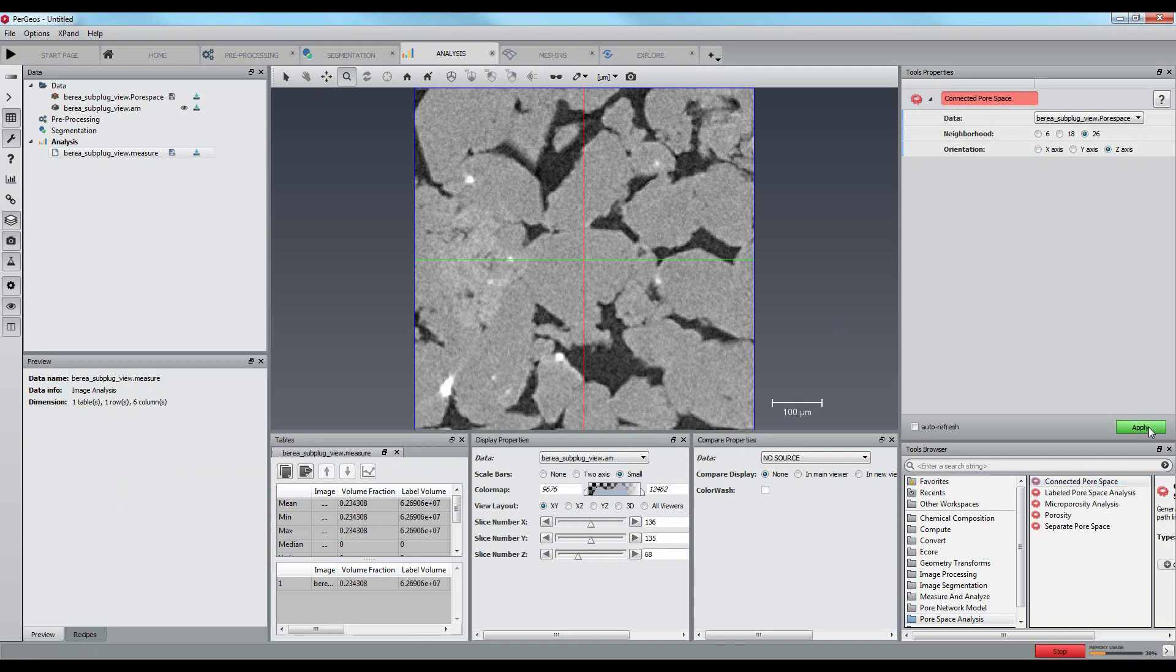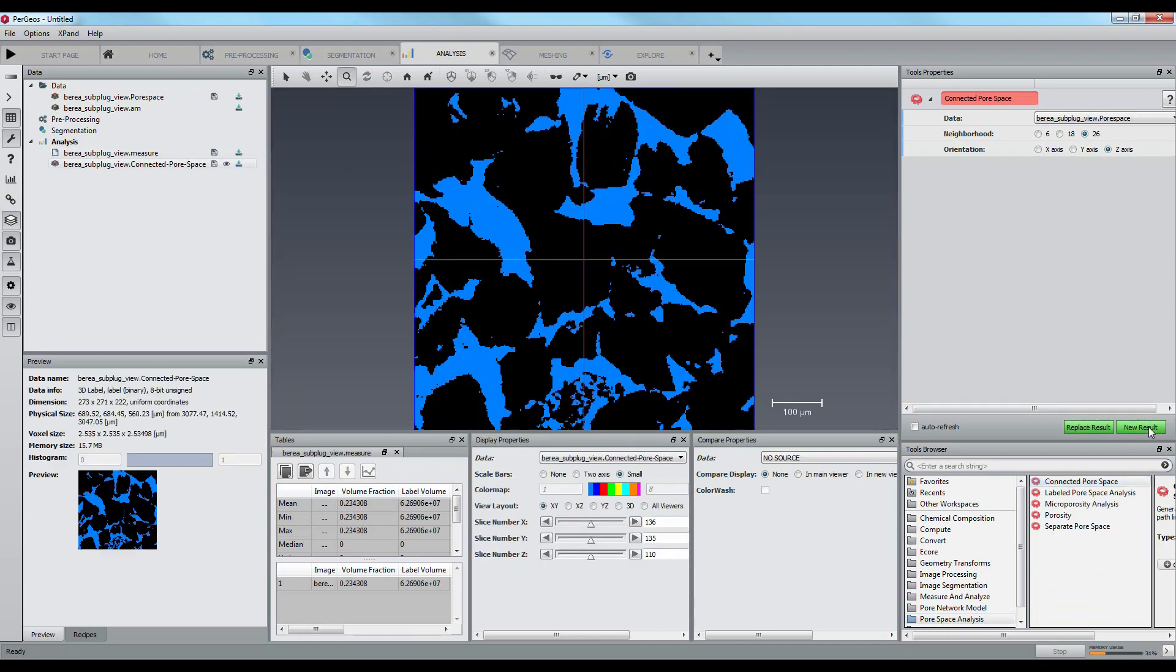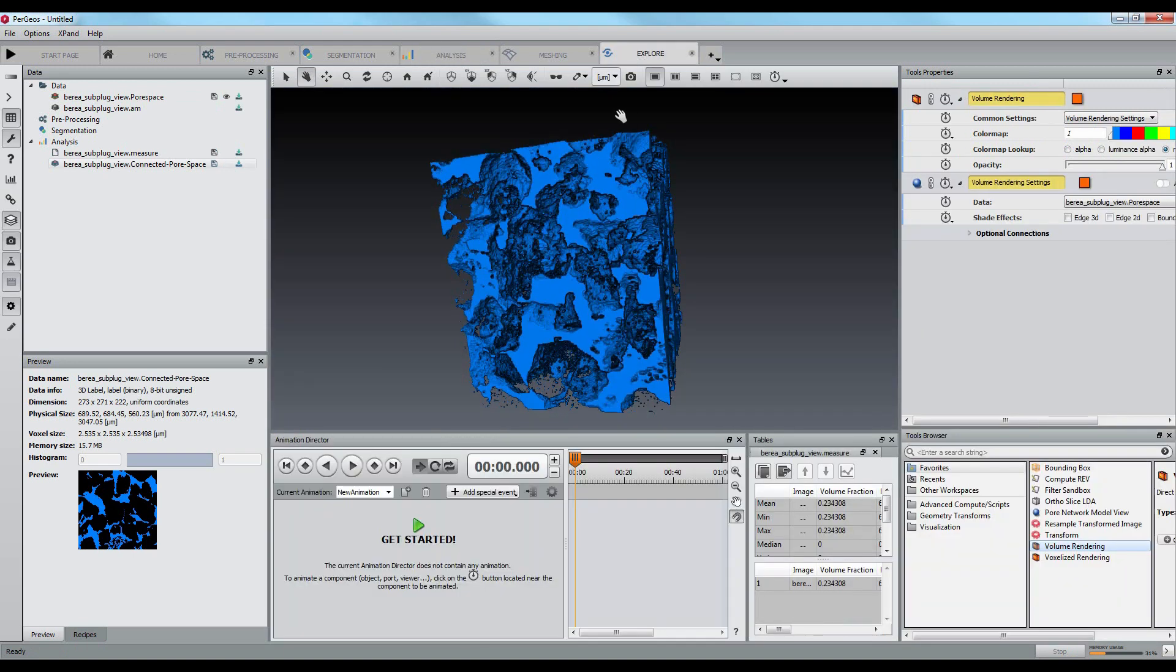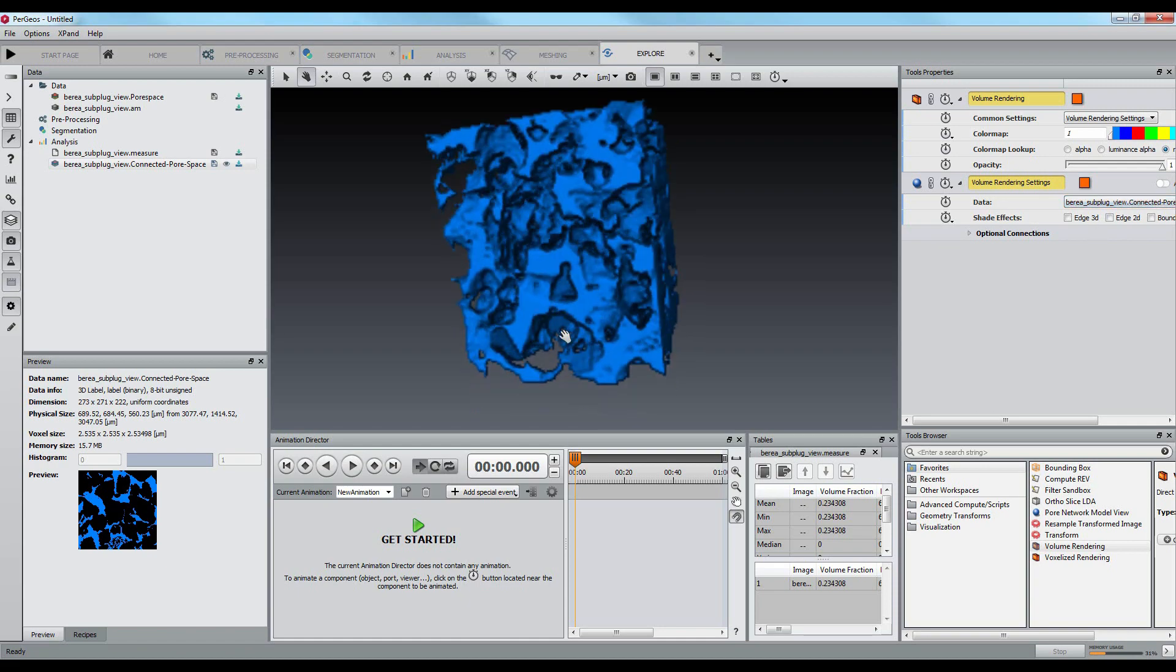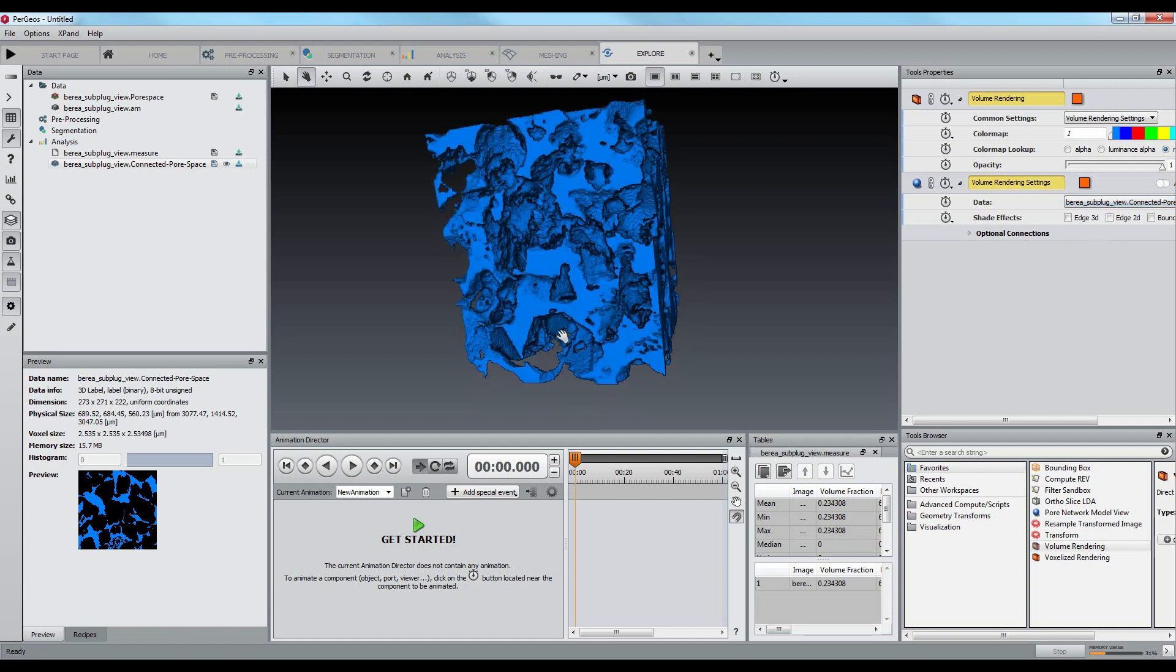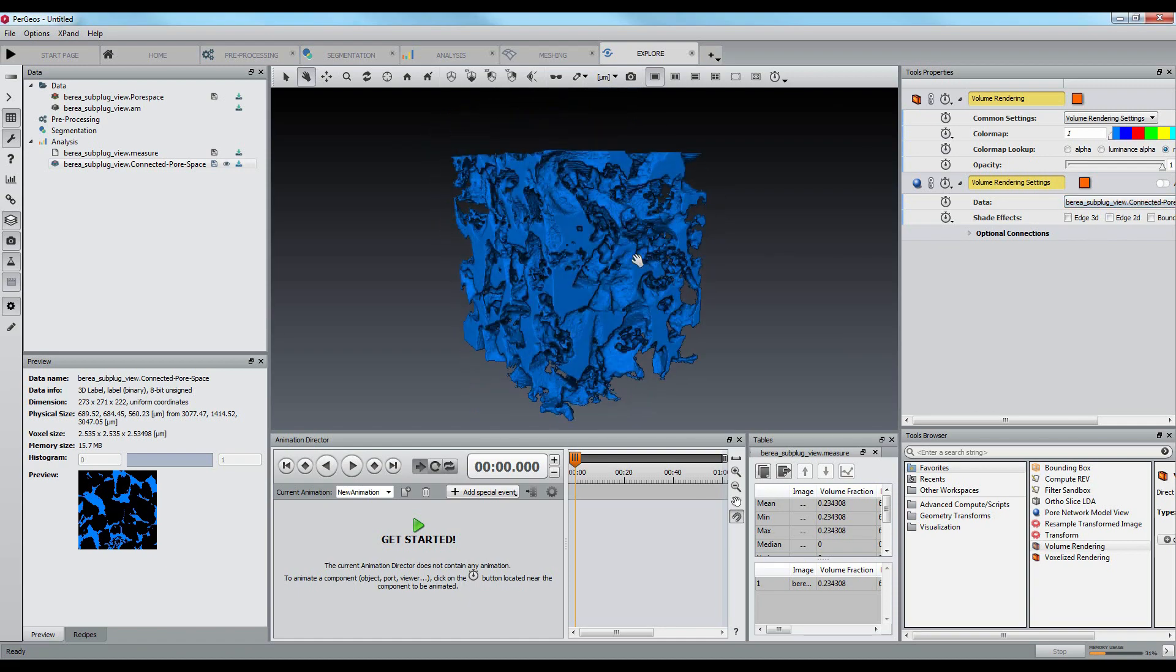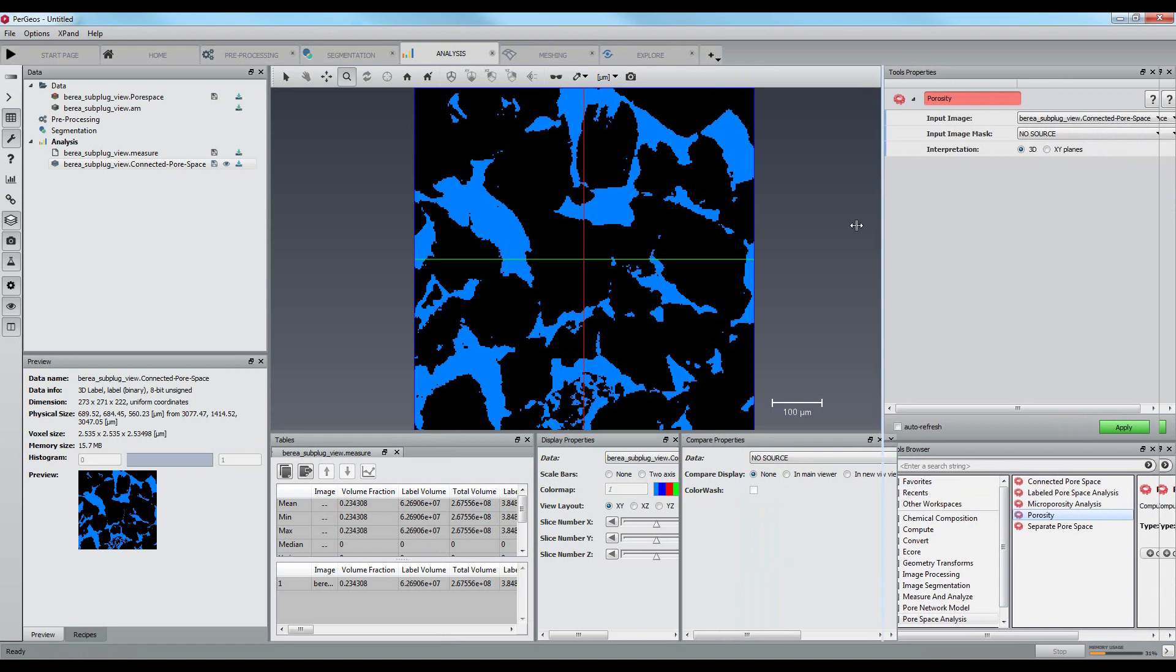After having computed the connected pore space, we can check with the 3D volume in the explore workspace that no isolated porosity is visible. We obtain a value for the connected porosity of 23.19%.